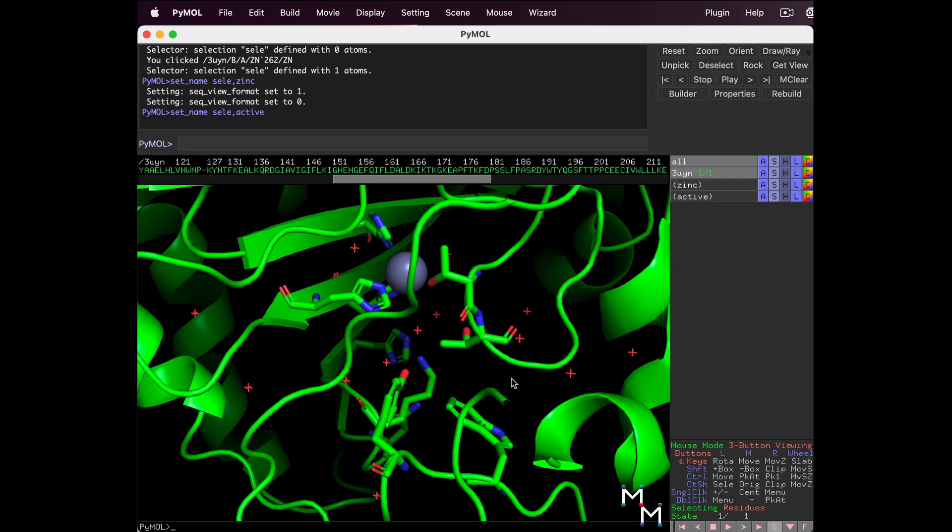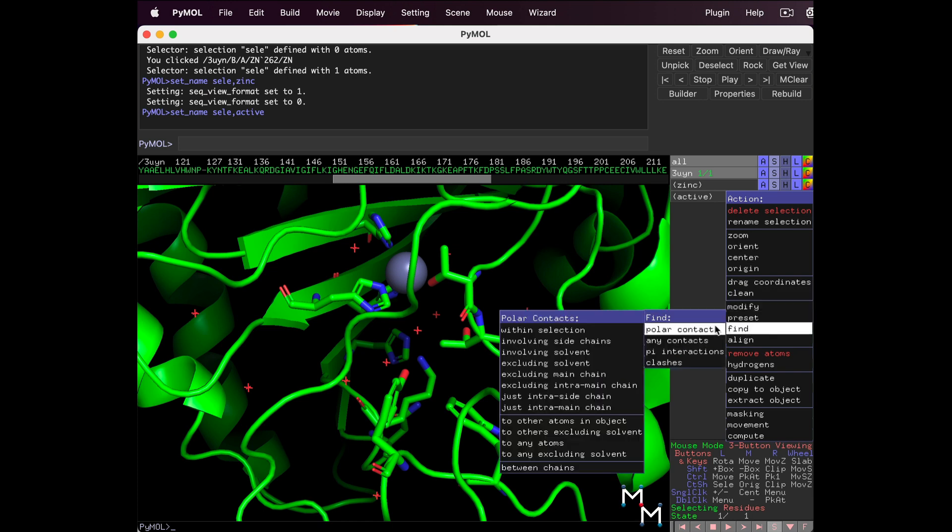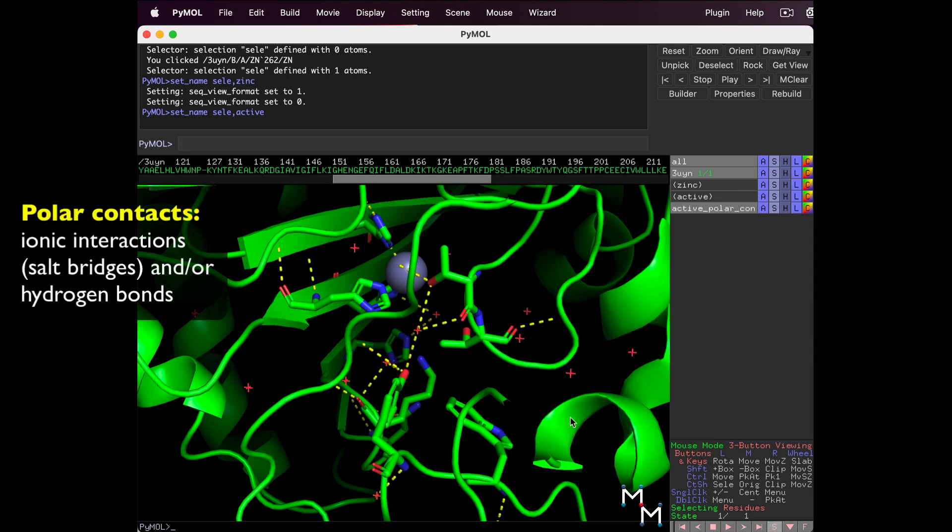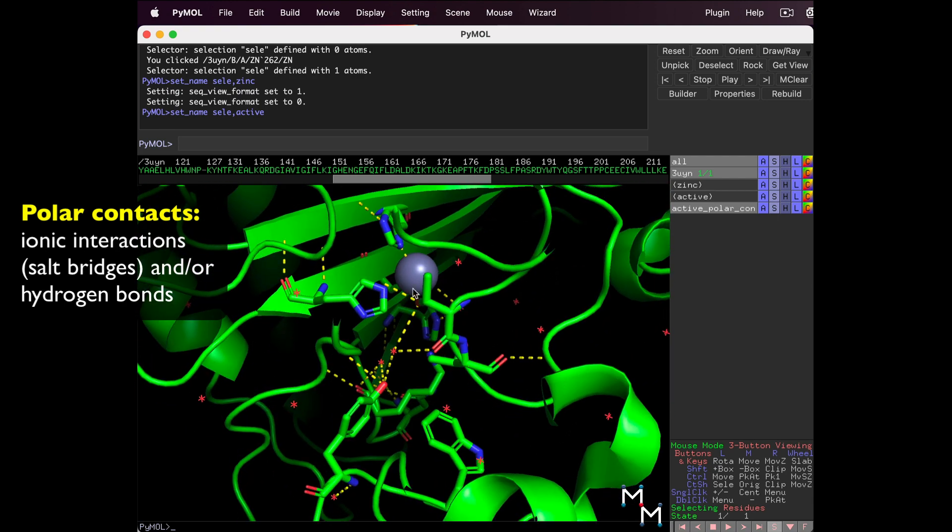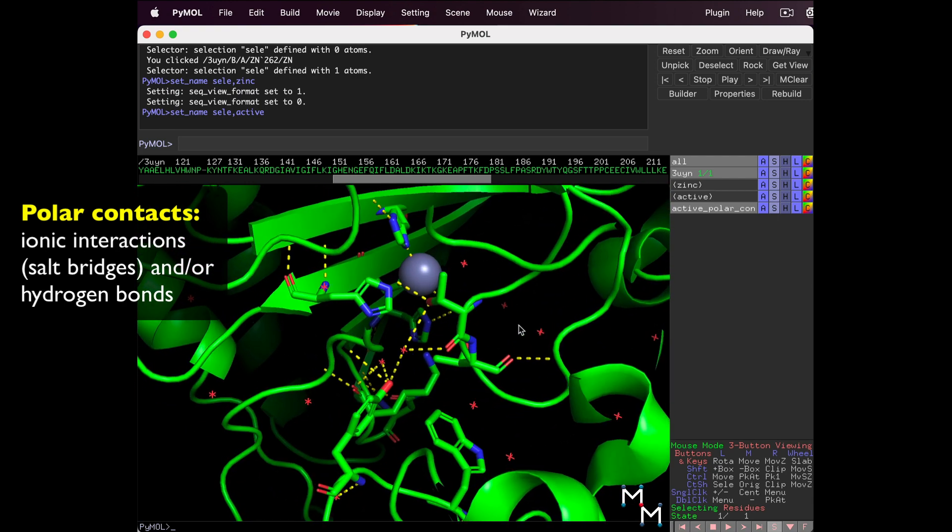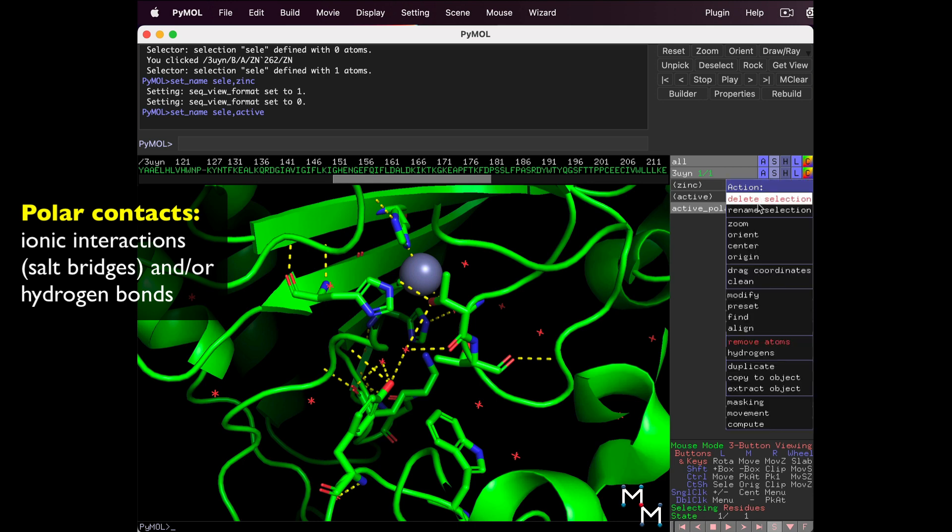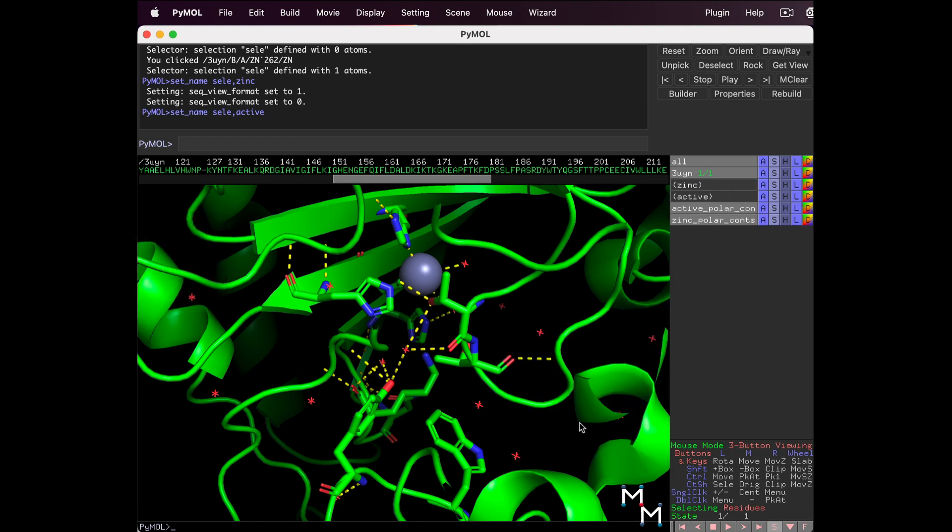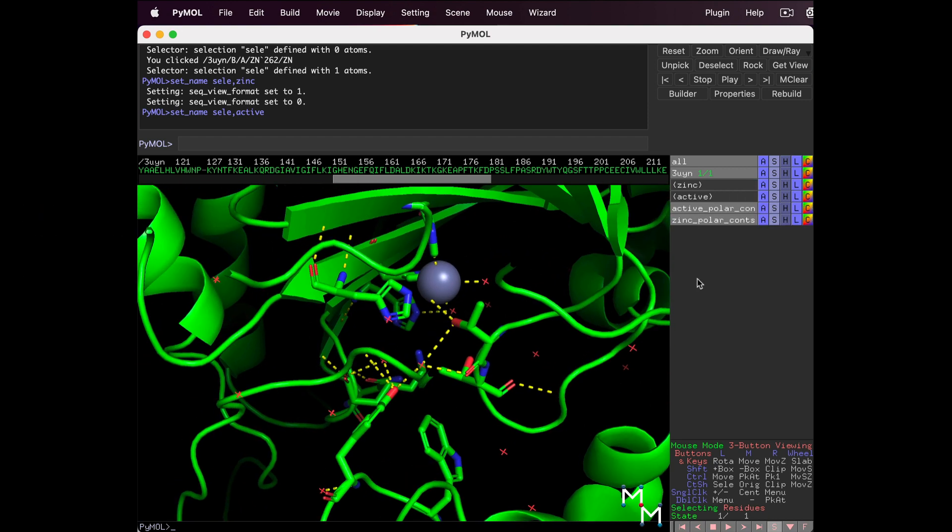PyMol can automatically find the interactions that polar atoms make. Find Active in the Names panel. Click A, Find Polar Contacts to Any Atoms. Notice yellow dotted lines show the interactions. Let's do the same for Zinc. A, Find Polar Contacts to Any Atoms. Now we have two different sets of contacts in the Names panel.